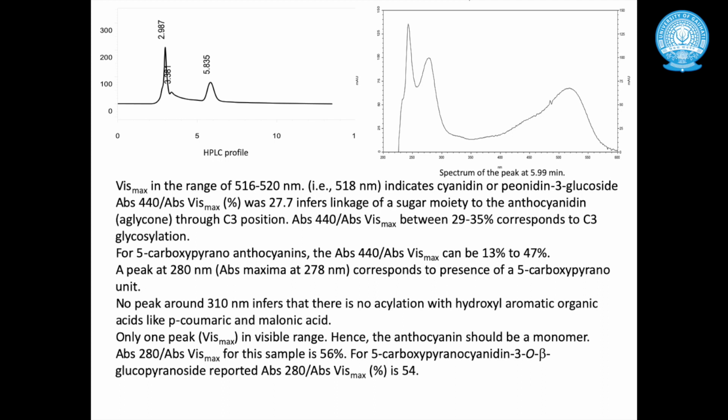I think some time back I said that the peak should be in between 400 and 450 nanometers, but I stand corrected that the peak should appear in between 300 and 350 nanometers, not 400 and 450 nanometers.